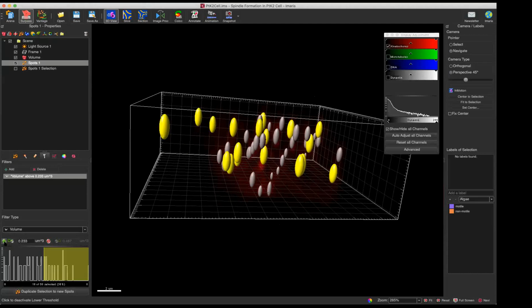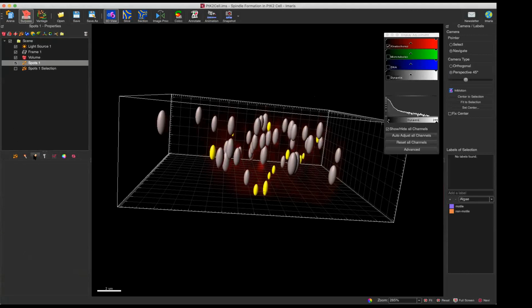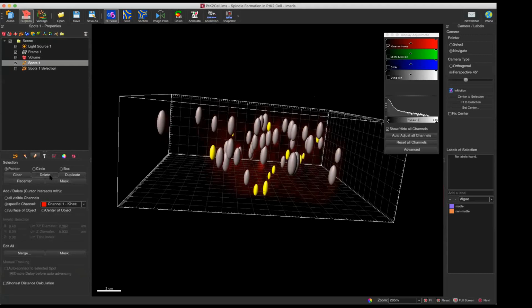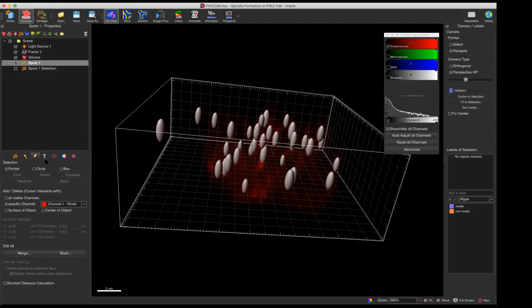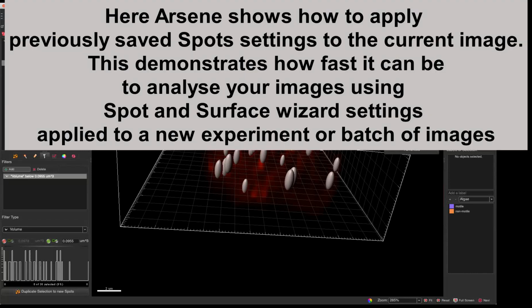Or if you want to delete the small ones, we can use the upper limit here and select the small ones, and here the edit, we can delete them. All right, so either way you can do, and not only one statistic, you can also add multiple statistic in this filter tab. Somehow it's frozen, so I may need to restart.